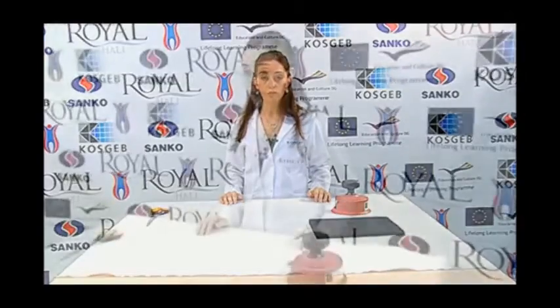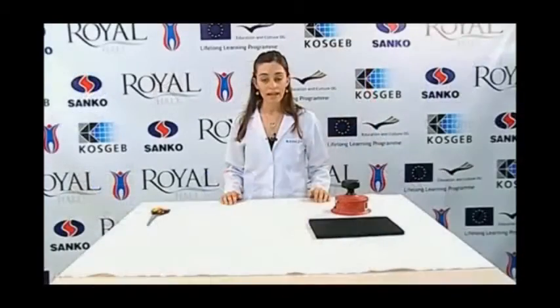There are several methods for determining the mass per unit of the fabric. Thus, all the methods should be examined carefully and the most suitable one chosen. However, it should be kept in mind that none of these methods is absolutely superior to the others in terms of accuracy. This test is applicable to fabrics that are produced in the form of rolls or pieces. As mentioned, the determination of the mass per unit can be done via different methods, and today we are going to determine the mass per unit with small samples.